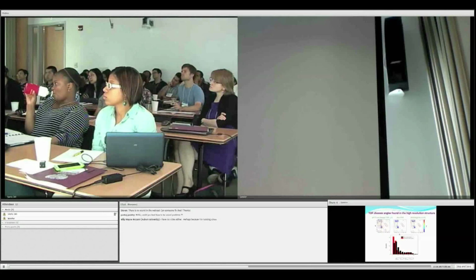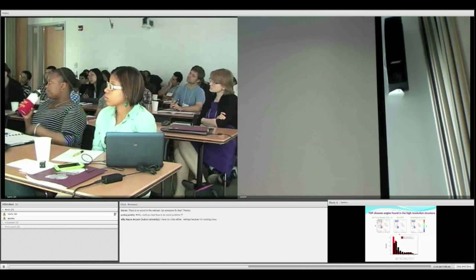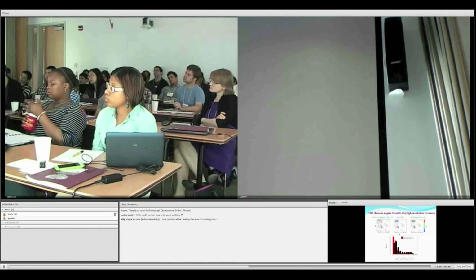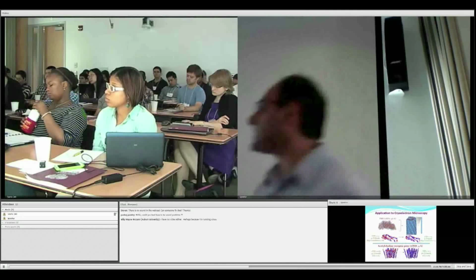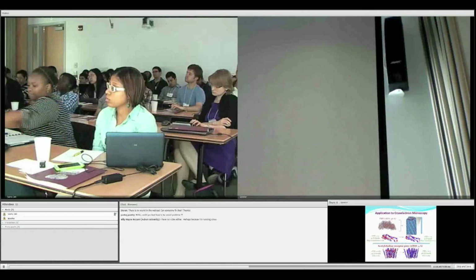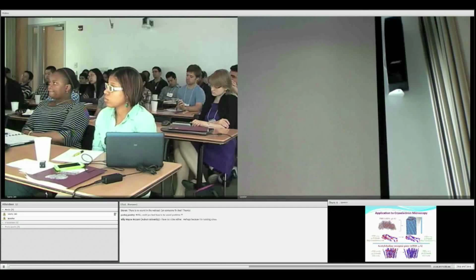Another important question is: okay, we move the dihedral angles, but would we get closer to the high resolution data? Let's say I work on two structures that exist in two resolutions, one high and one low, and I start with the low resolution. Would I go toward the high resolution data or not? And this is an example.